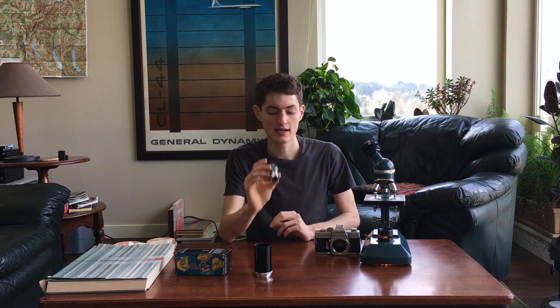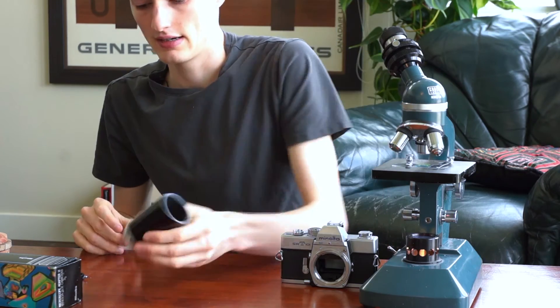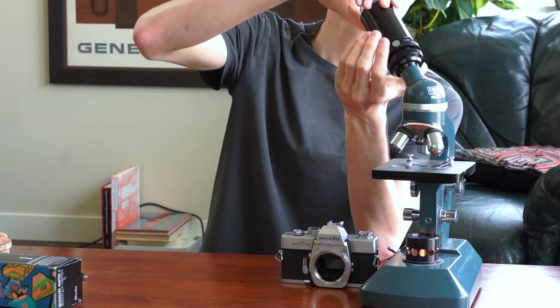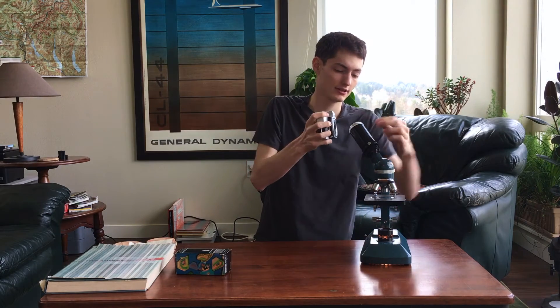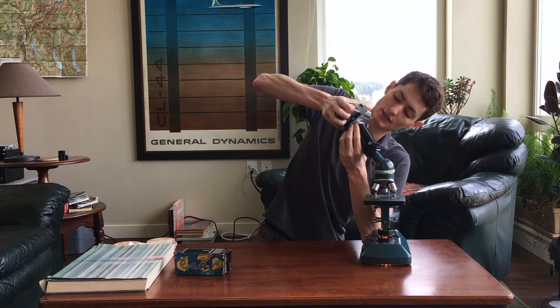Next I'll take the eyepiece itself and just put it back into the eyestalk. Then I'll take the final part, the lens barrel, and screw it in place. Now I'm ready to actually mount the camera onto the microscope. I'll take the camera, find the little red dot, and mount the camera onto the SR mount.